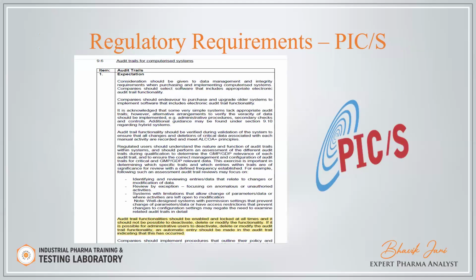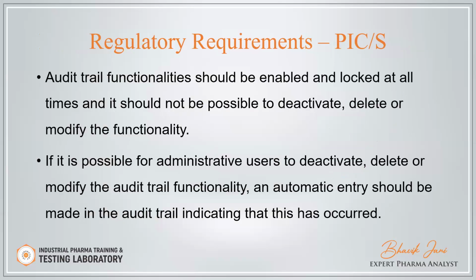What about PIC/S? PIC/S says that the audit trail functionality should be enabled and locked at all times, and it should not be possible to deactivate, delete, or modify the functionality. The audit trail functionality should be enabled all the time. Audit trail activity should not be disabled by any user, including the administrator.